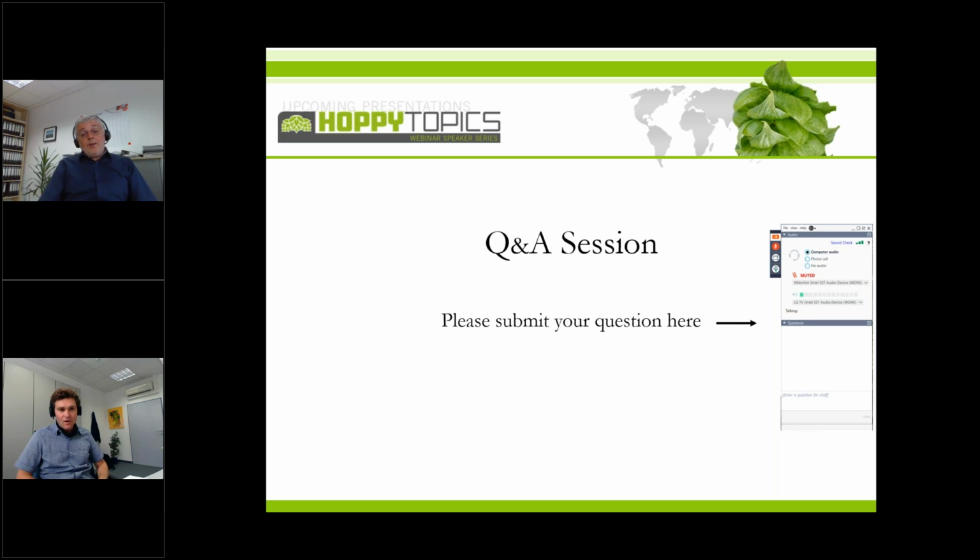As you can see from our studies, we judge 4-MMP as the most important one, the lead compound for the fraction of thiols. We are fully aware that there are many others, and there are also precursors and so on. But in my opinion, 4-MMP can be a kind of lead substance, because it has a very low aroma threshold and you can find high concentrations in beer. Therefore we were interested in analyzing a range of different hop varieties for this compound.